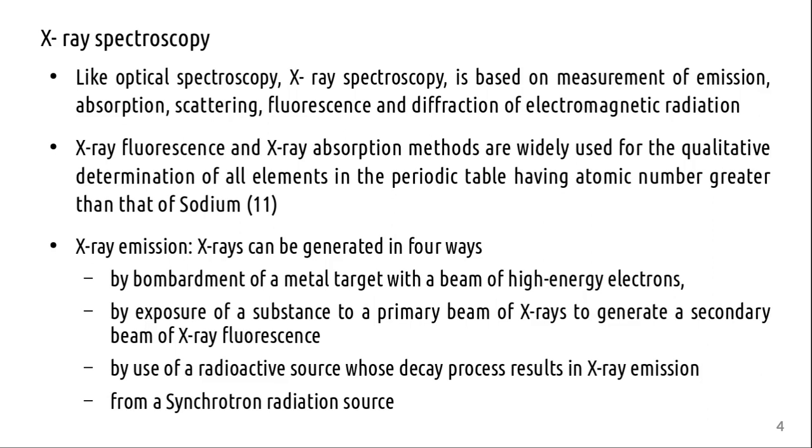When X-rays interact with matter, they undergo absorption, there is fluorescence, diffraction as well as scattering. Except for scattering, the rest of the three find use in analytical studies. So we are aware of how X-rays are generated.